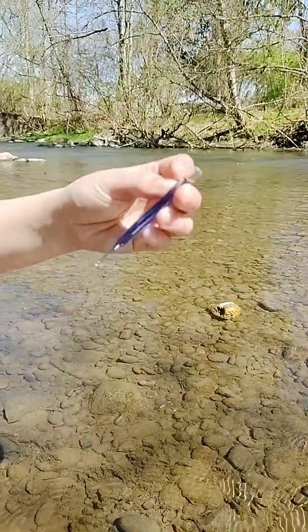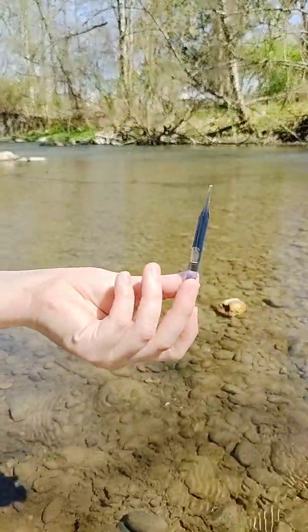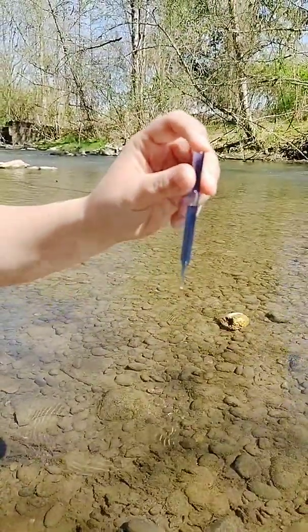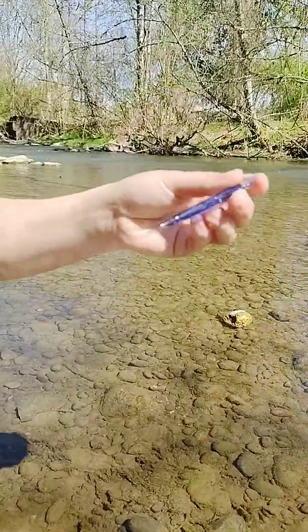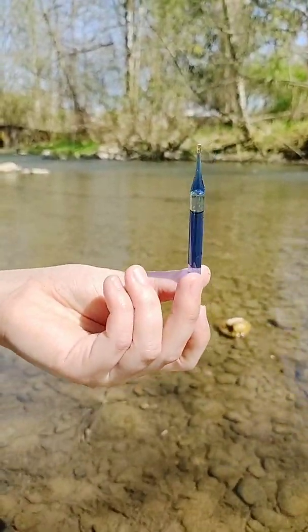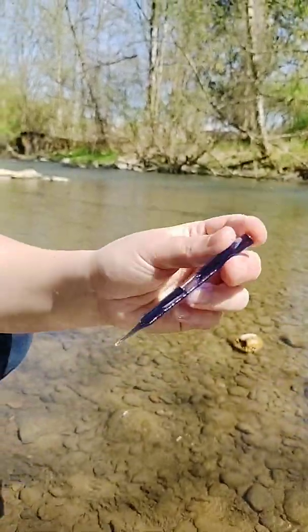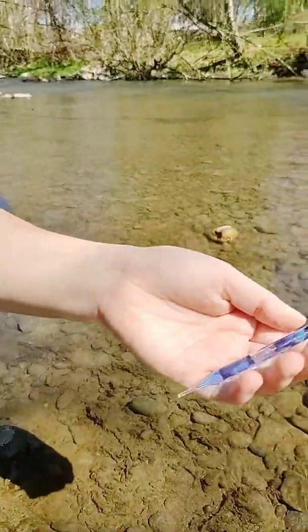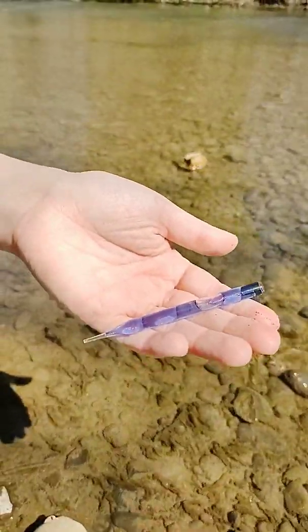But now we're going to take this ampule and we're going to kind of just do the same thing, go back and forth. You're going to see the little bubble float to the top, and now again, we'll do that a couple times. Yeah, so after a couple times of that, generally you're going to want to wait 2 minutes, but I already did it for us earlier, and here's kind of the color that it's turned out to be.